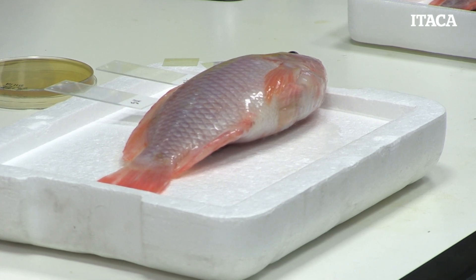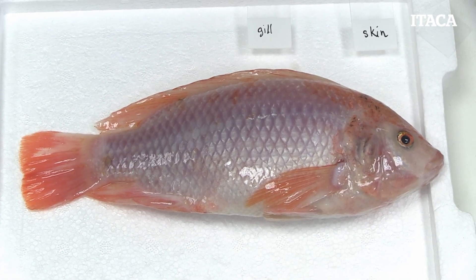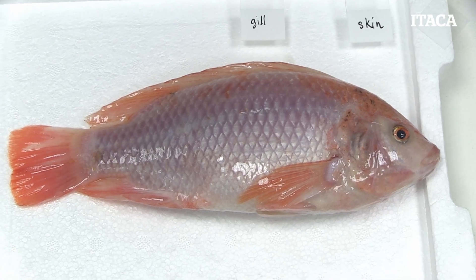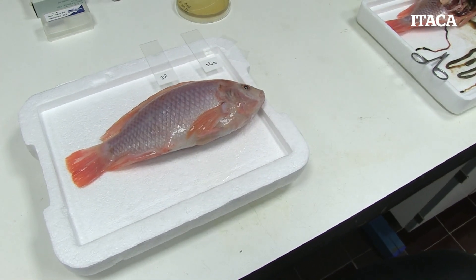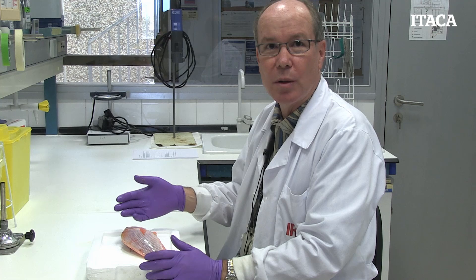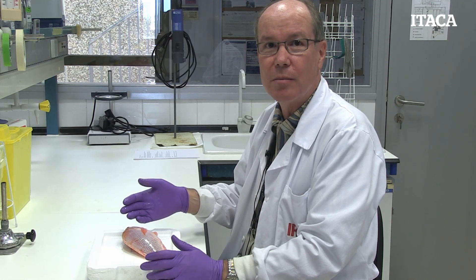We want to look at fish in as natural a state as possible while they're still alive. You don't want to be doing necropsies on fish that have been dead for a long period of time, because the post-mortem changes can mask any infectious processes. As soon as the animal dies, bacteria and other parasites quickly take over. So you want to be sampling a fish that's still alive or at the very least moribund.